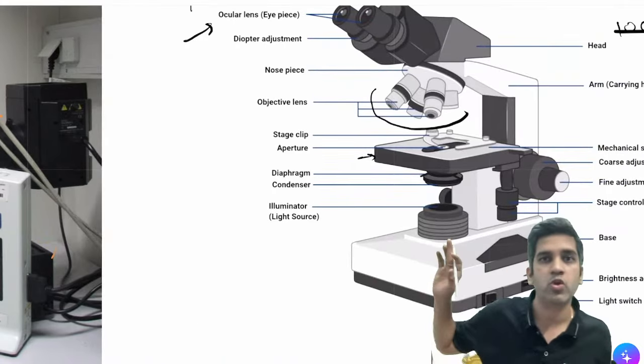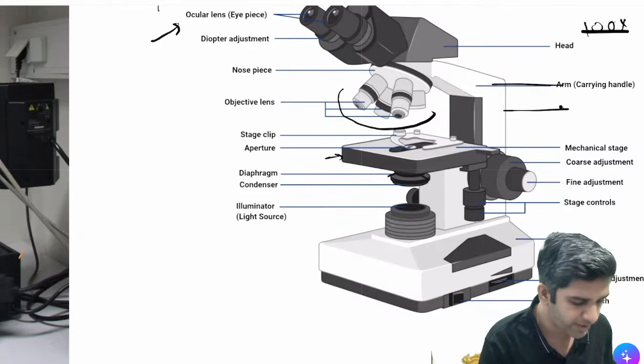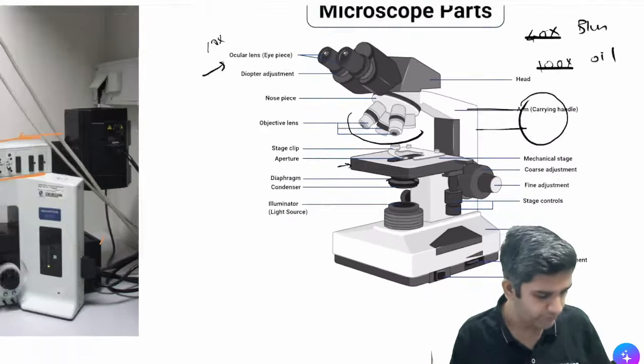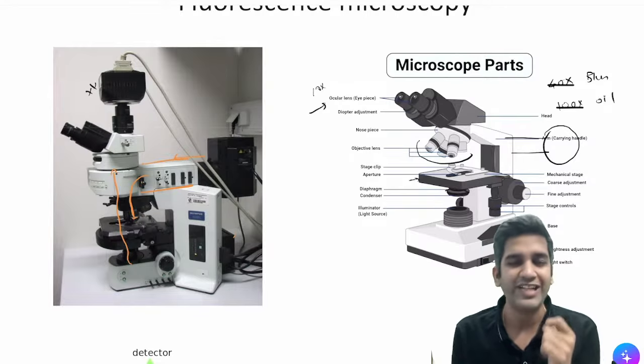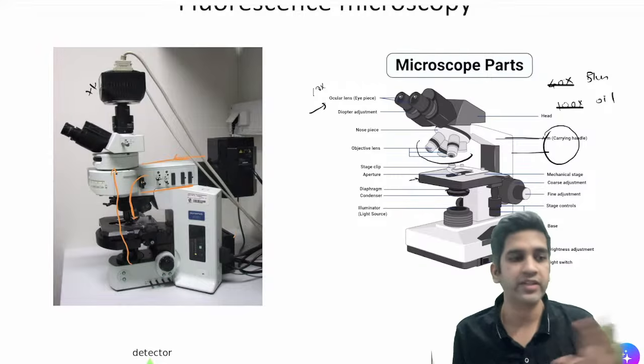A light microscope will not have anything of the sort. Something in a fluorescent microscope will be protruding like this. If it protrudes like this and this light shows there, that's a fluorescent microscope, right? Next, the principle. Why do we use fluorescent microscopy? We use it for a few very important diagnostic details which we will be reading in the latter half of systemic pathology with the next batch, right?